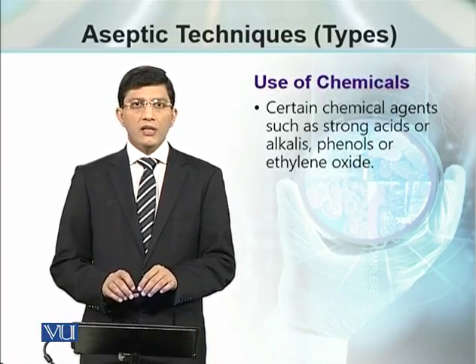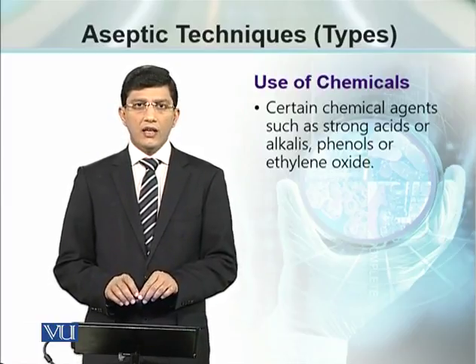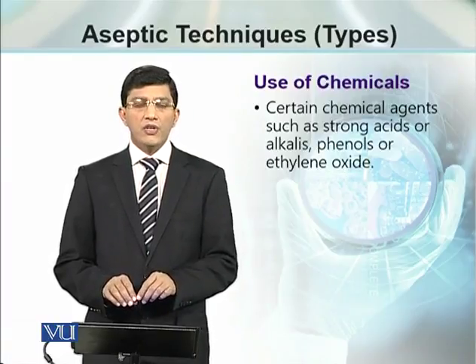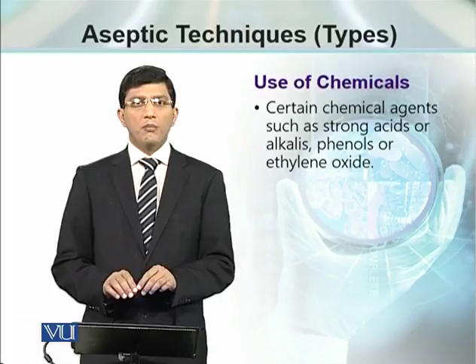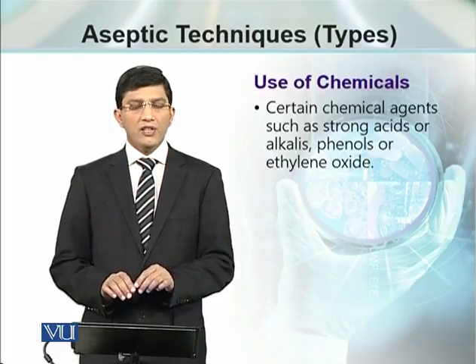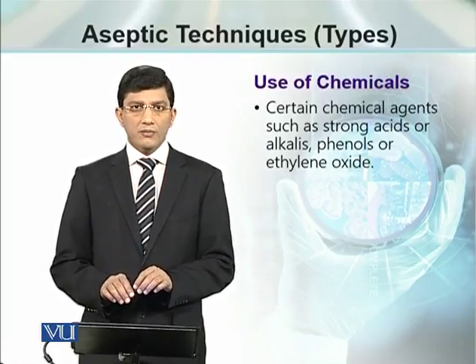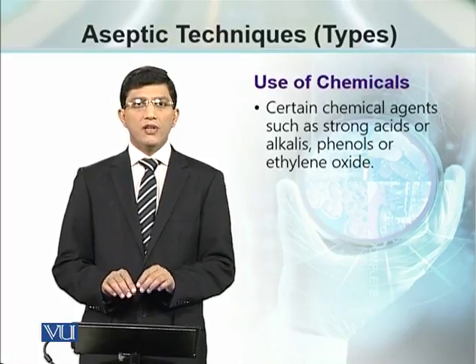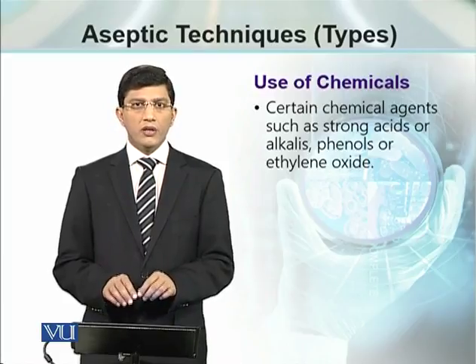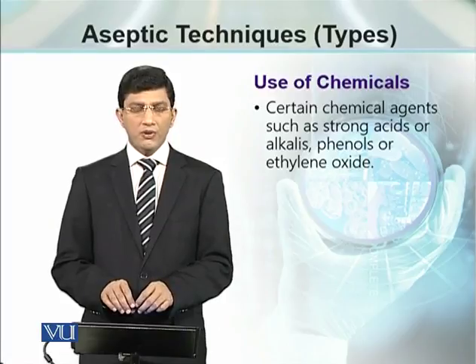Then we have certain chemicals like strong acids, strong alkalis, phenols, ethylene oxides, which can be used to make the benches or equipment sterilized. However, this method is not preferred for the sake of safety of the researcher. Obviously, you will not be interested to work with a strong acid and clean a bench or a piece of equipment.